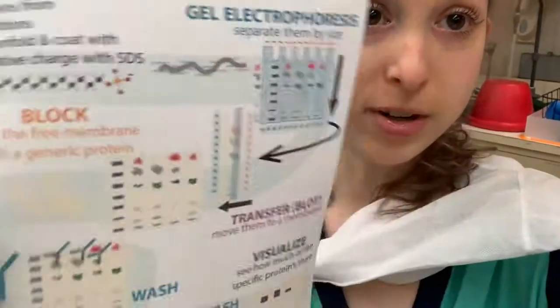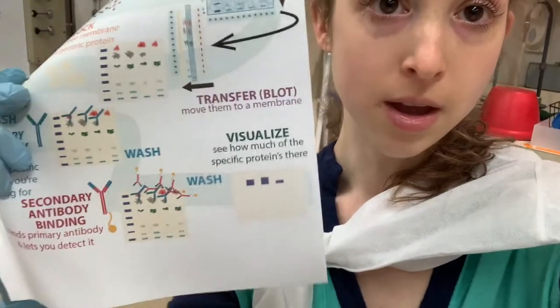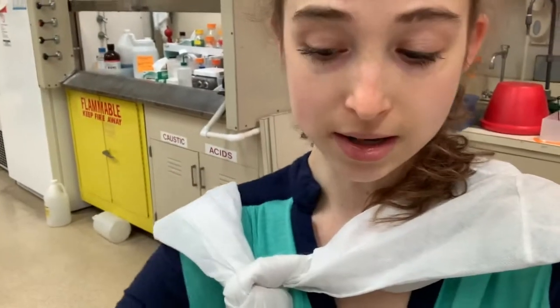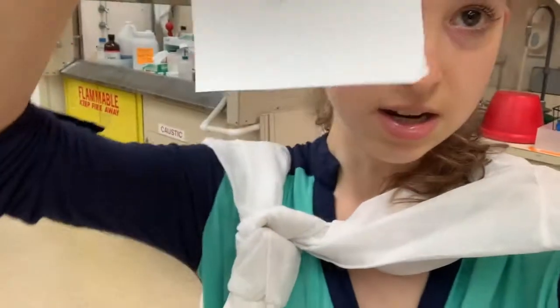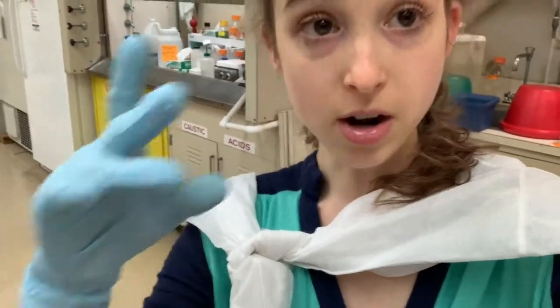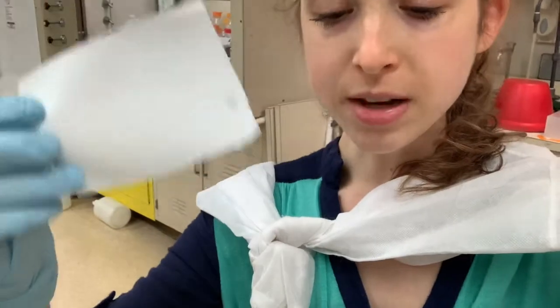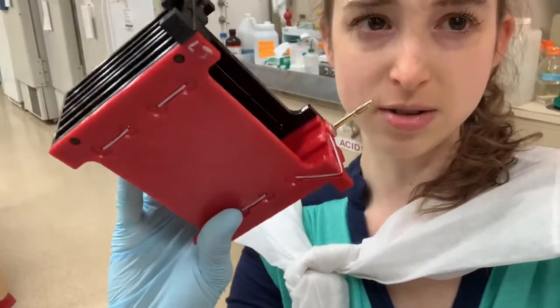We're going to use those antibodies to look for the various proteins in the sample, but first we need to transfer the proteins out of the gel and onto a membrane. Typically it's a nitrocellulose or PVDF membrane — this is nitrocellulose, the same type of stuff used for slot blots. It's just a little sheet that'll bind to proteins, and we want to get our proteins out of that gel and onto this membrane.